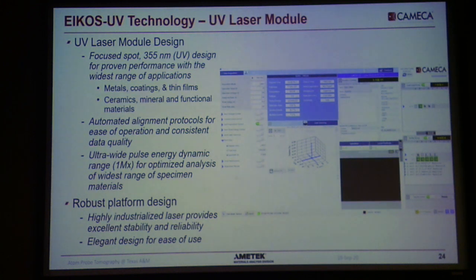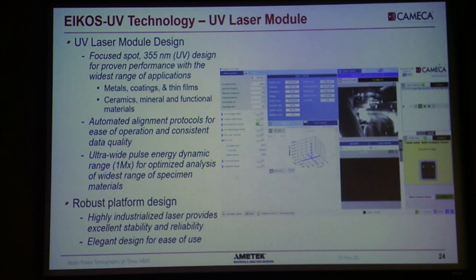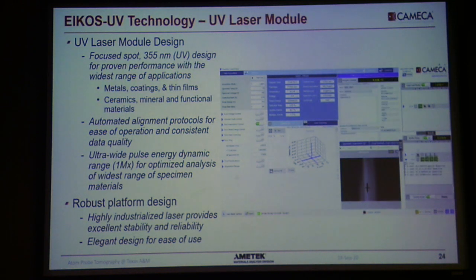So that means that if I'm gonna play that now. You see, it started here already where you have some automation, transfer assist. The automation, which means that if you want to move a sample from the buffer chamber to the analytical chamber, you click on a button and it positions exactly the puck before the entrance and opens the gate valve. All you have to do is use the horizontal rod to put it in, and then when you click on laser, it's gonna go and do the laser search on its own. Okay, so it does the laser search on its own.